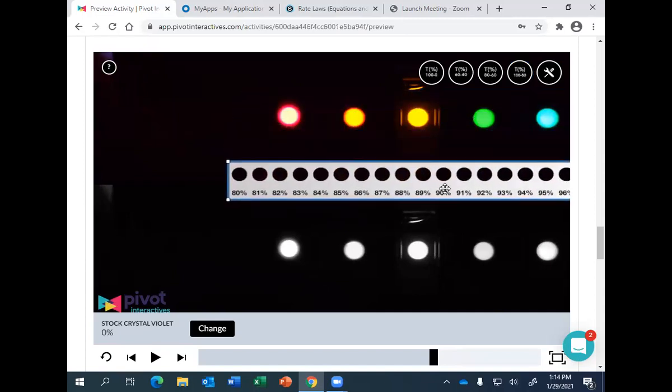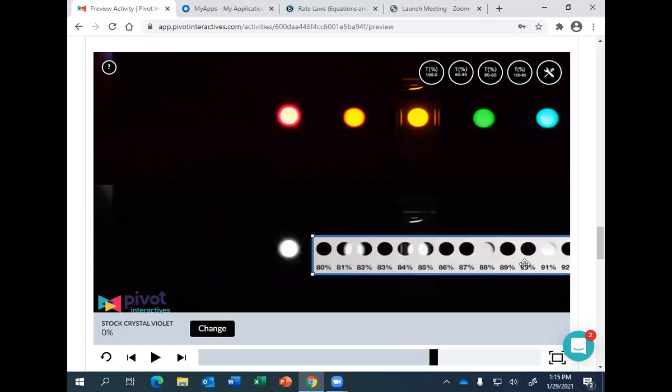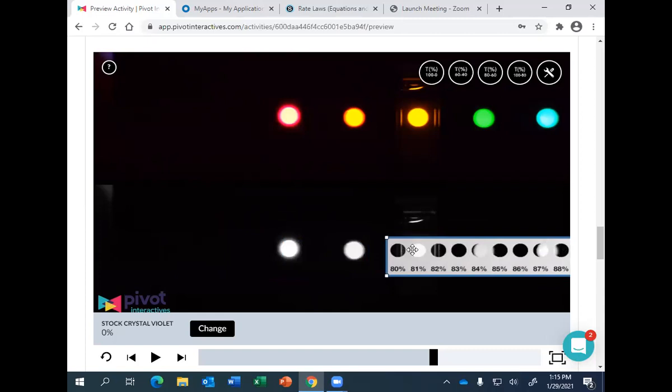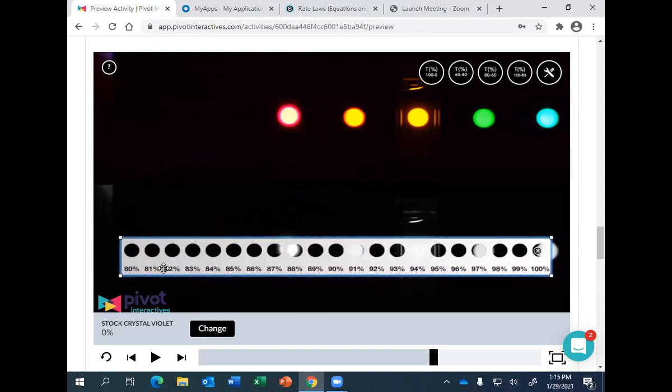You drag this little ruler down here below the yellow. We're looking at this circle here and trying to match it to the background color. As I have it down here, do you see how the circle is whiter than the 81% background? But as I slide this to greater transmittance, like 94% transmittance, you can't detect the circle from the background.